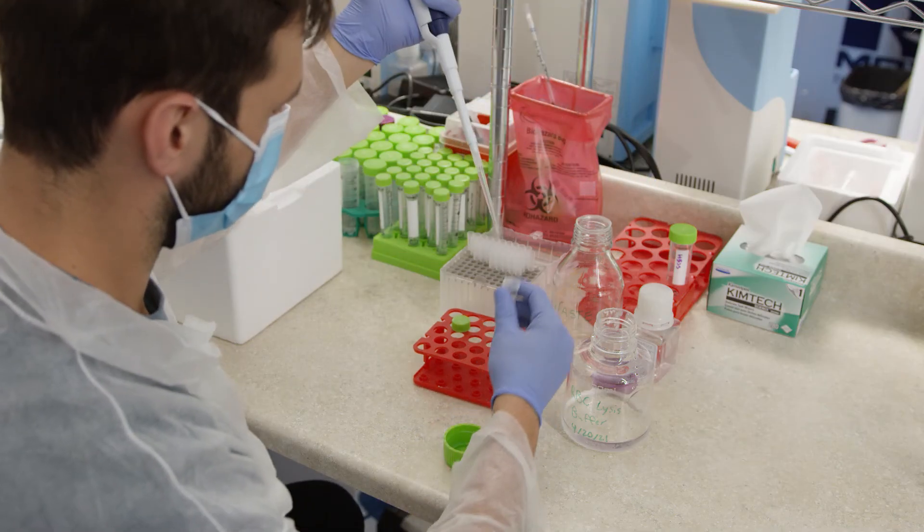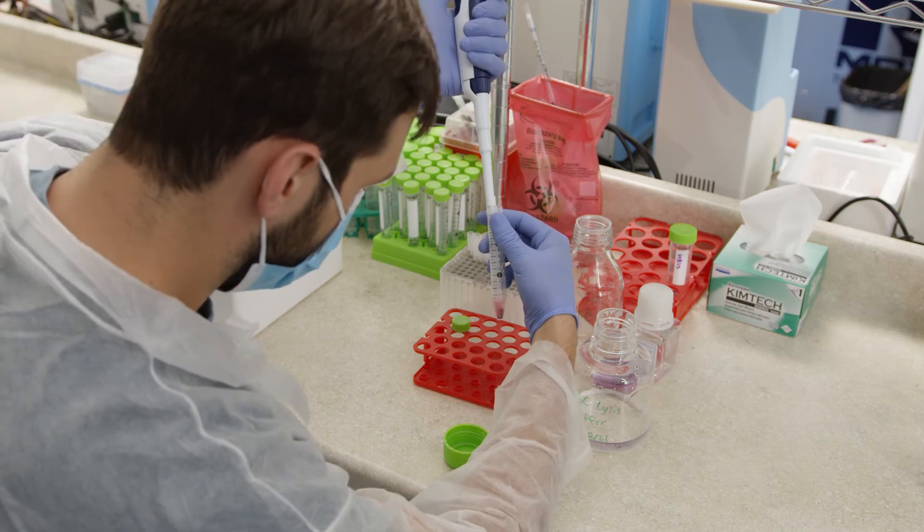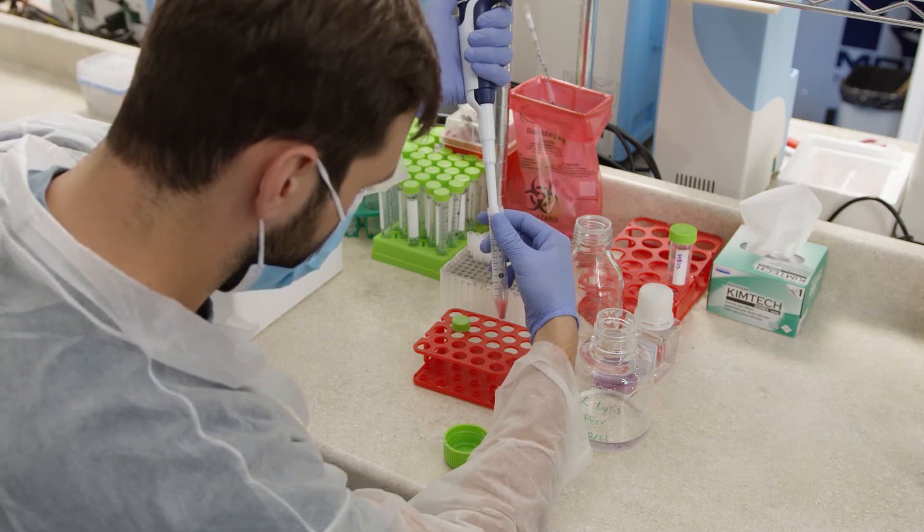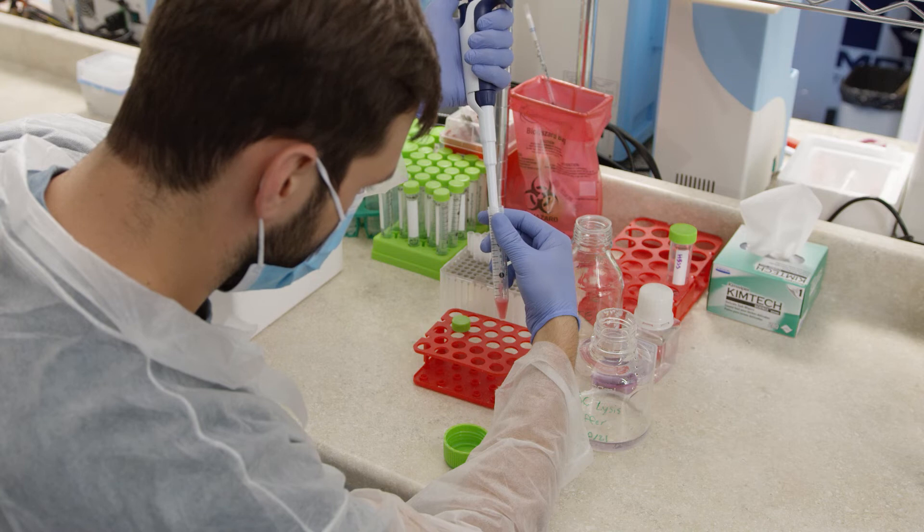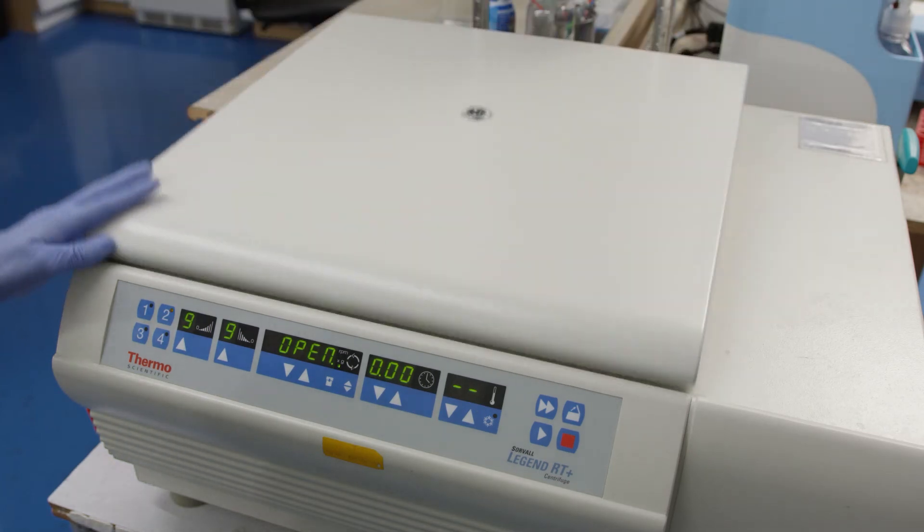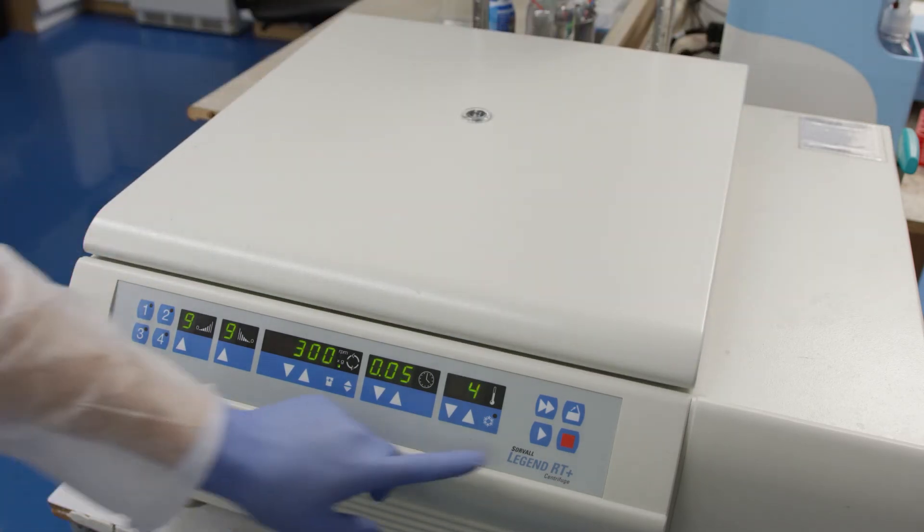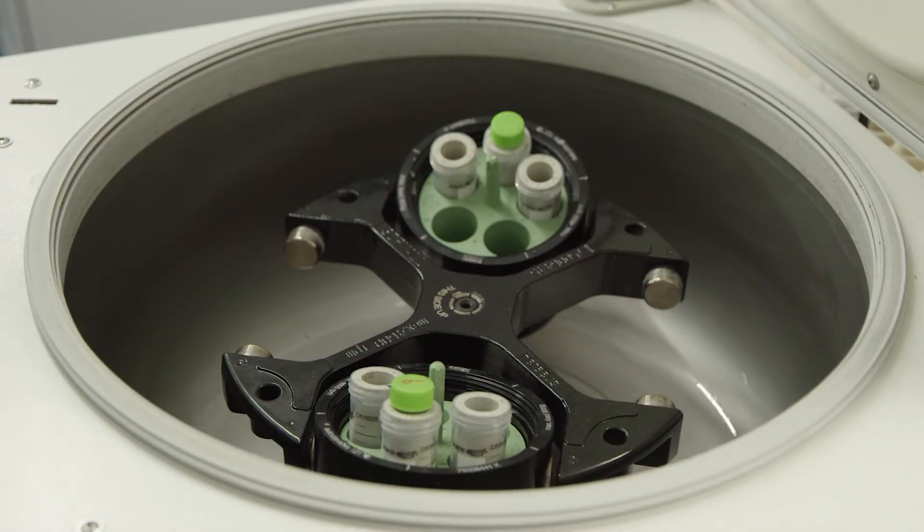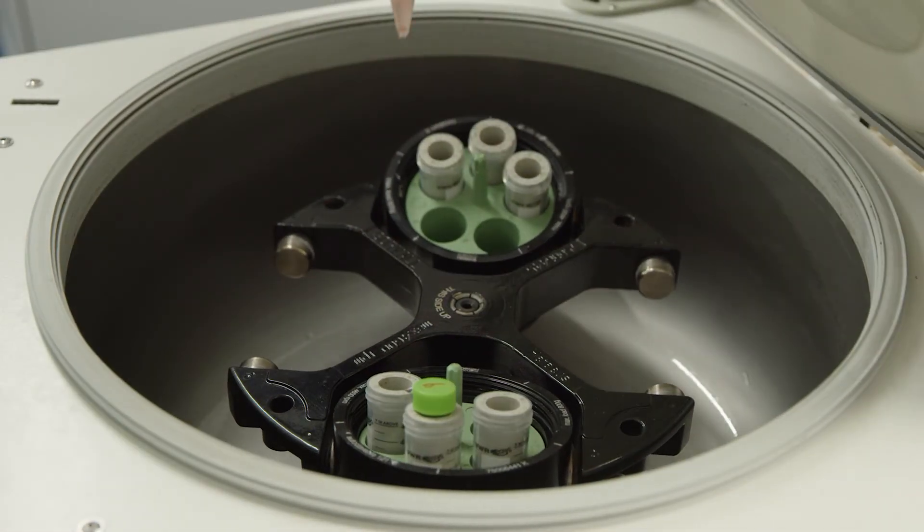Add 1 milliliter of RBC lysis buffer and incubate for 1 to 7 minutes depending on your tissue type. Refer to the Singulator user manual for recommendations. Centrifuge the sample at 300g for 5 minutes. Remove the supernatant and re-suspend the pellet in the appropriate buffer or media for your cells.